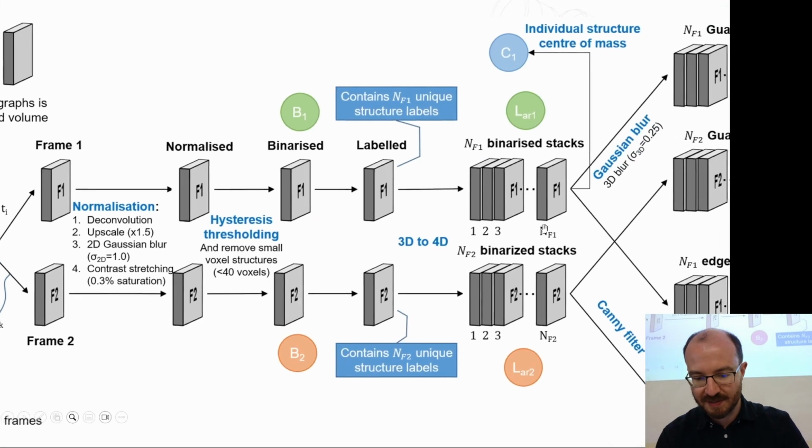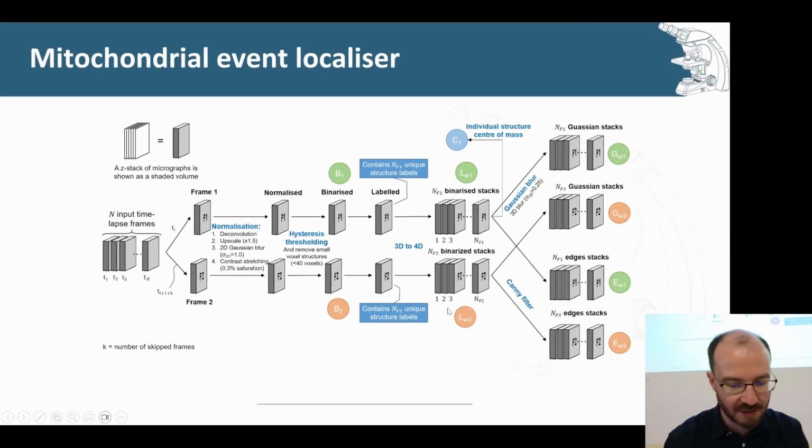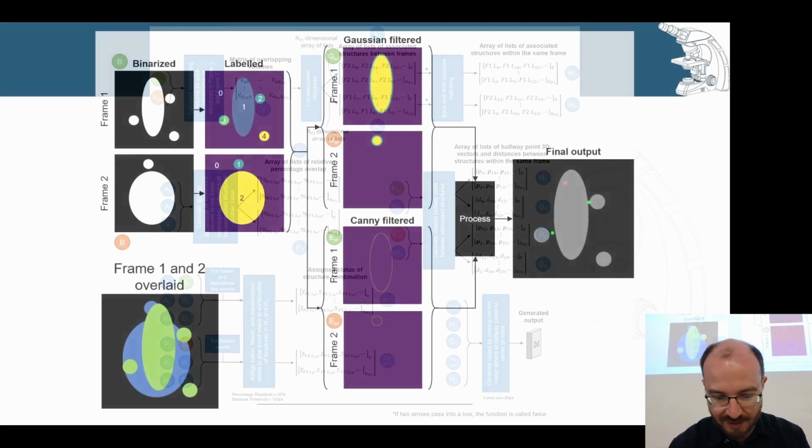Then there were some other steps that I did. I'm not going to go through them. Did some edge detection. The latest version of this method doesn't rely on edge detection. Lots of comparison of matrices and whatever else. Eventually you get to the result.